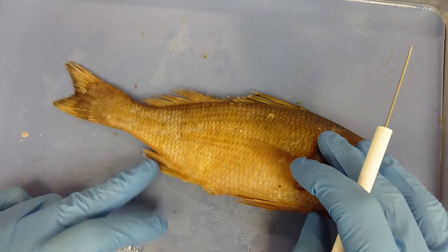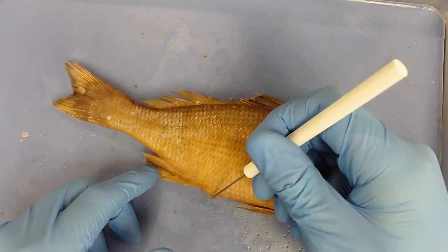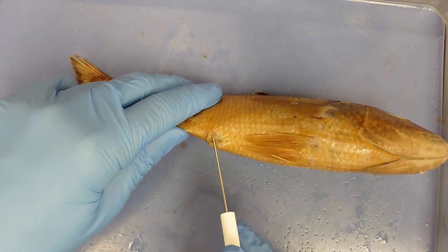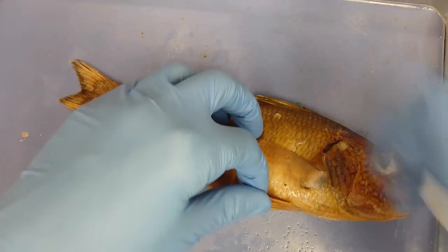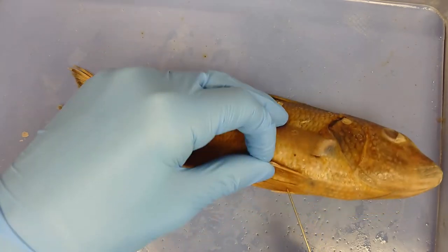The anal fin is just posterior to the anus or vent. Just anterior to the anus or vent are the pelvic fins — there's a pair of them, one on either side.